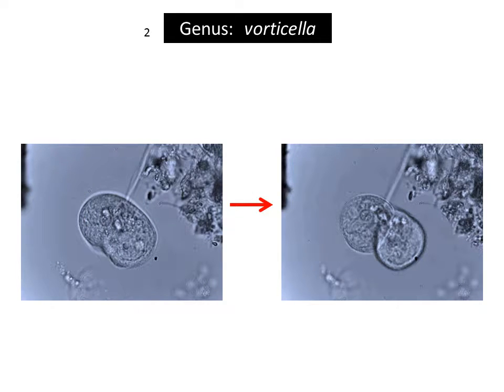Contrary to some implied descriptions in the literature, the telotroch does not develop as a smaller bud at the base of the parent cell, but rather as an equal-sized daughter cell formed by longitudinal binary fission of the parent cell.